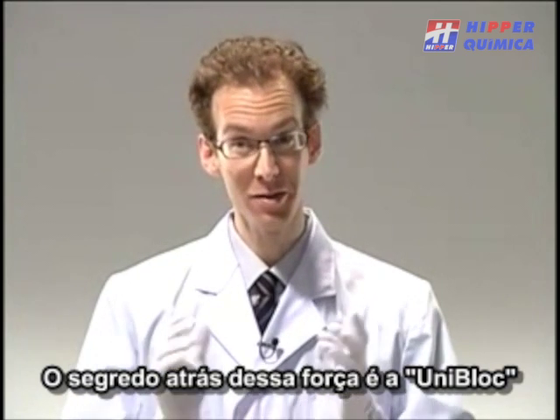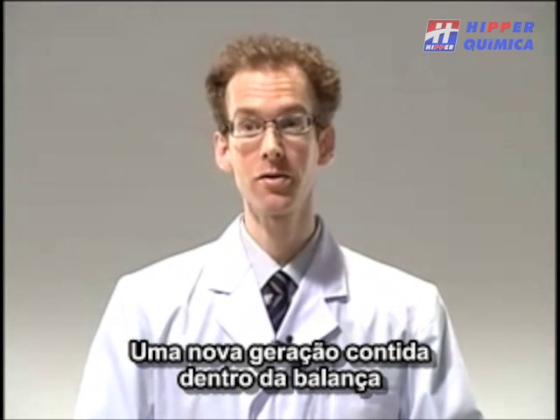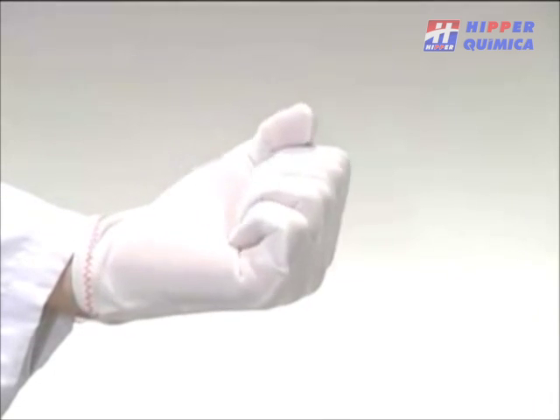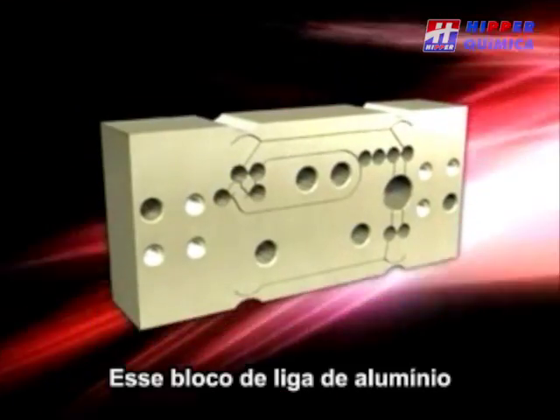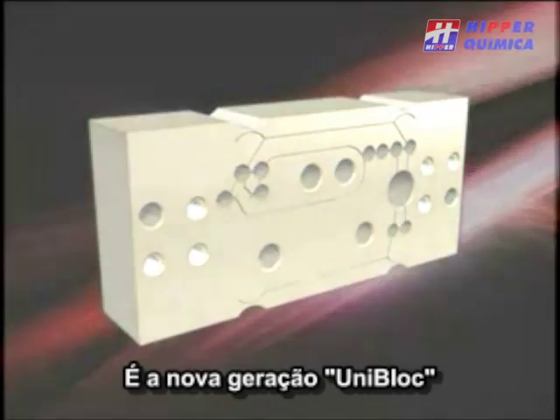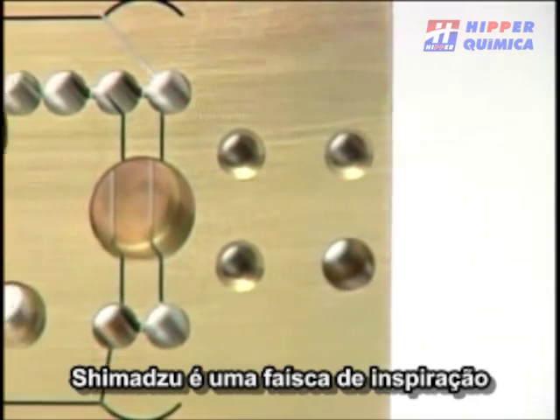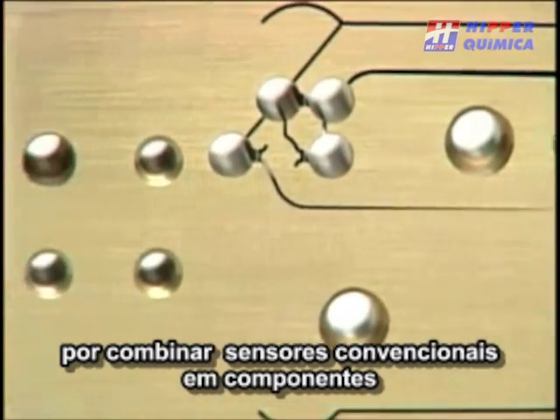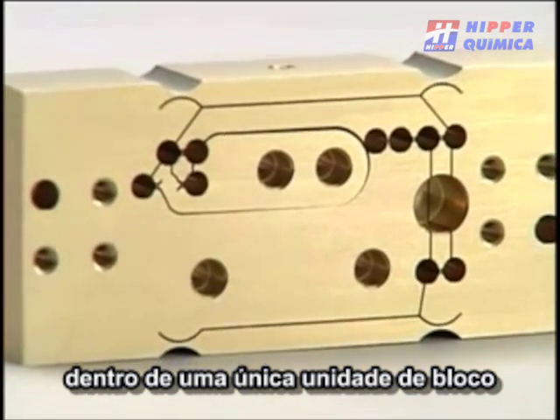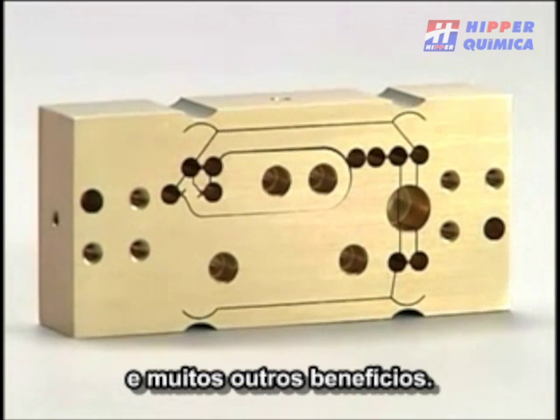The secret behind this strength is the UniBlock, a new generation mass sensor built right into the balance. This block of aluminum alloy is the new generation UniBlock mass sensor. Shimadzu's spark of inspiration to combine conventional sensor components into a single unified block has led to improved shock resistance and many other benefits.